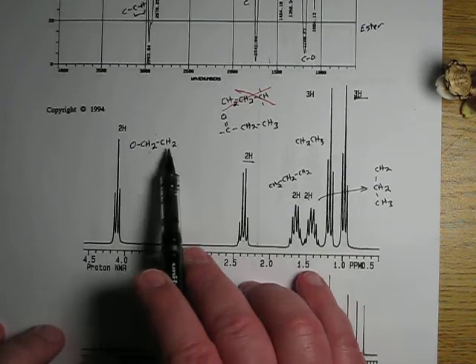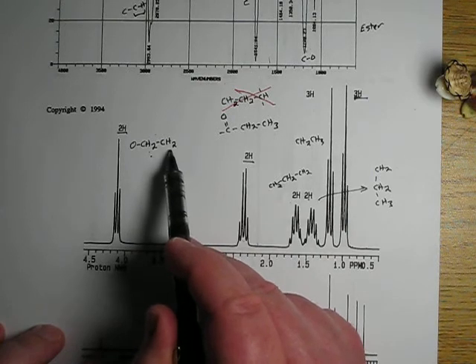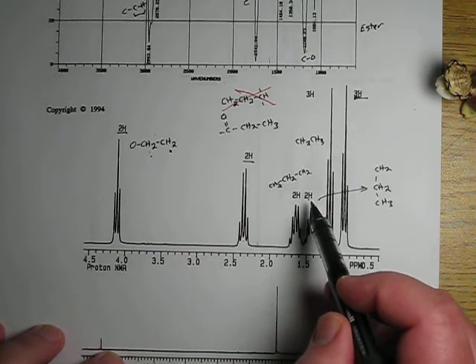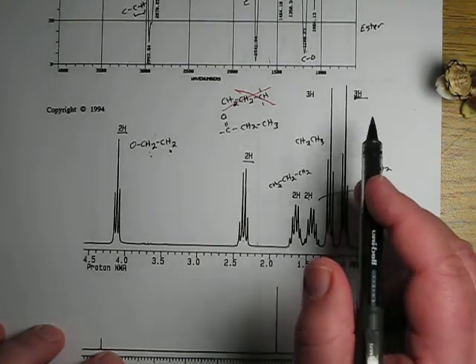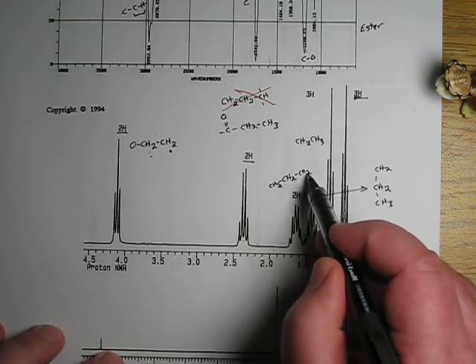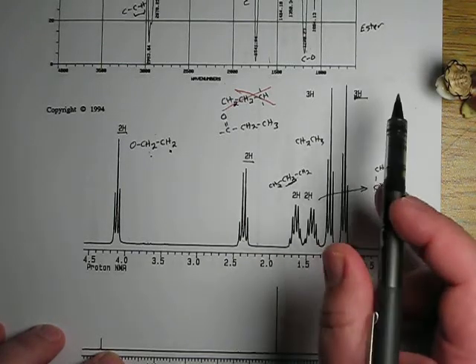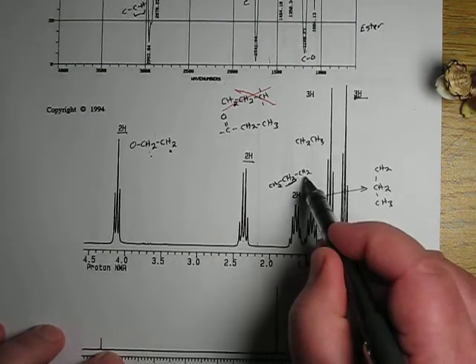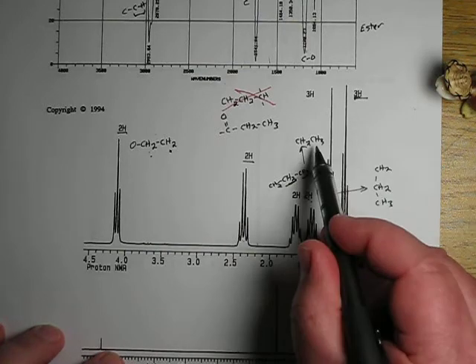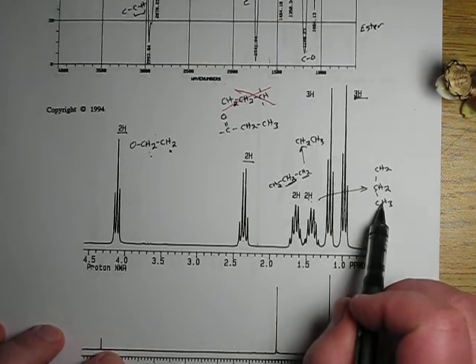We know we have an OCH2, CH2. Well, this CH2 is this one. Where is this CH2? It's got to be one of these two. So that's one of these guys here. And since it's CH2, it's this guy. It's that CH2. And realize that then this CH2 here is this one, which is the same as that CH2, because we know this one is a CH2 next to a CH3.